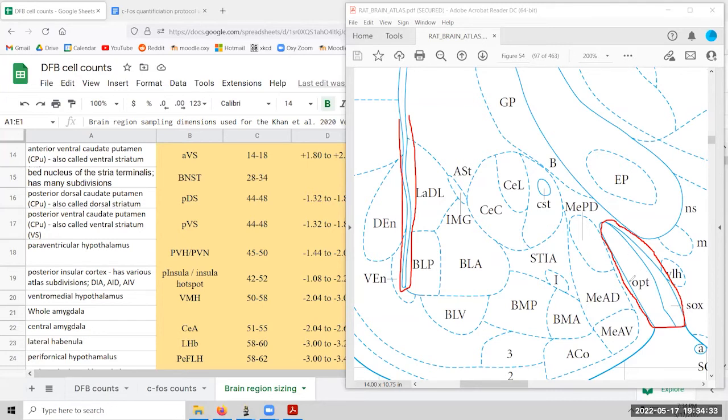This tends to be the most pronounced thing that is adjacent to the amygdala that will help us determine where we are, particularly if the image is at a weird angle. Another feature is that the optic tract does change its shape very reliably as you flip forward or backward through the atlas. Before I show you that, there is another landmark that may be helpful if it's visually apparent, which would be the internal capsule slash cerebral peduncle. It tends to have two different names depending on where you are in the atlas. So we've got these three key factors here.